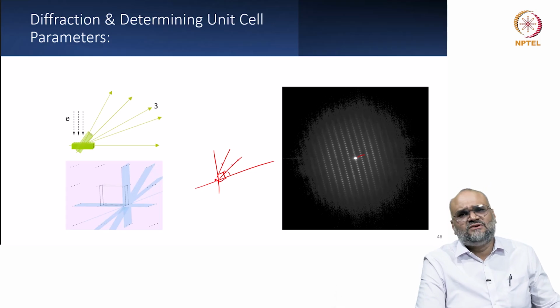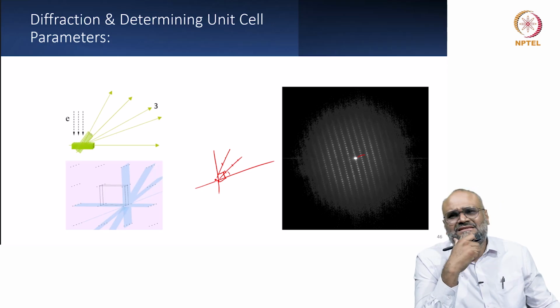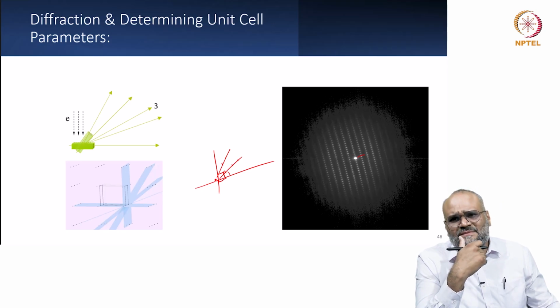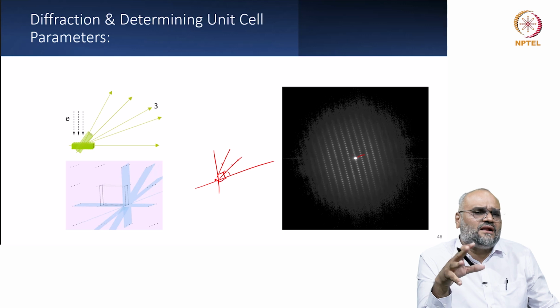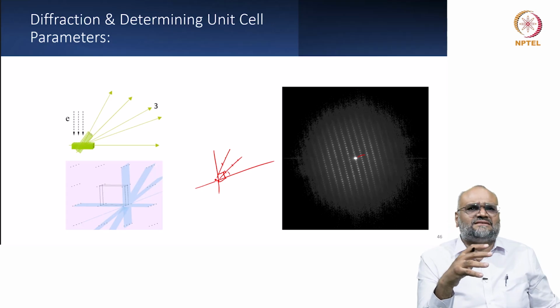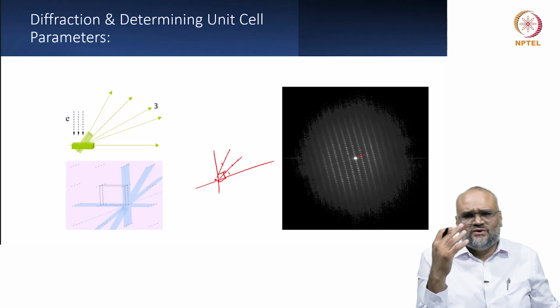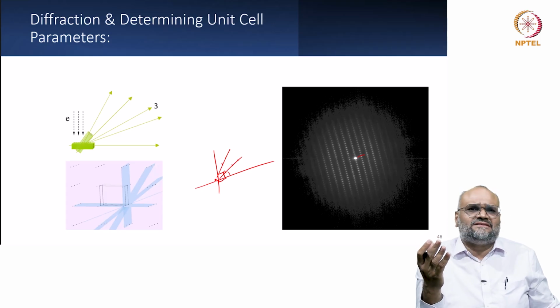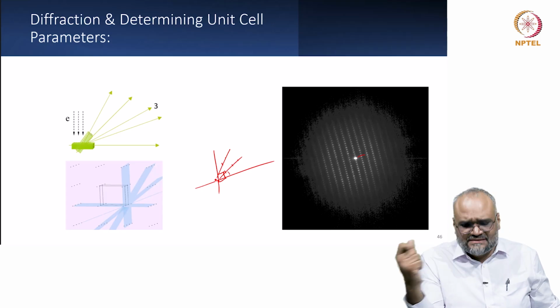So, this helps you determine the unit cell parameters very accurately, and once you know this, you can also get information on the symmetry either by corresponding X-ray diffraction pattern and by using Rietveld refinement methods, or by using convergent beam electron diffraction techniques and determine the symmetry, and then you would have solved the crystal structure to an extent. And then once you determine the space group through focus exit wave reconstruction imaging by high resolution electron microscopy, you can completely solve the crystal structure.